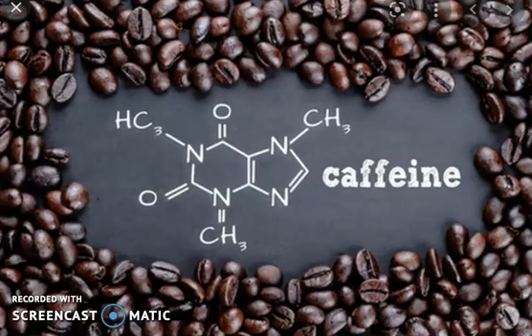So place 15 gram of tea leaves, 5 gram of calcium carbonate powder and 200 milliliter of water into a 600 milliliter beaker. Boil the solution on a hot plate for 20 minutes, with occasional stirring. Occasional, not continuous. You know the stirring process.